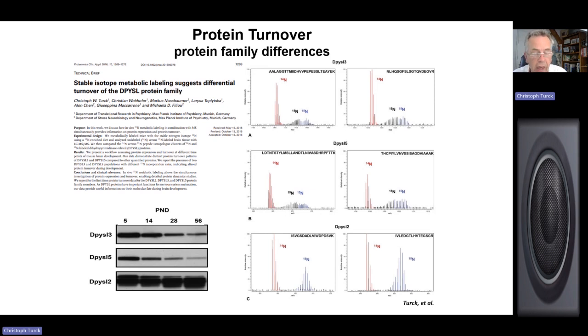You would isolate neuronal cells, astrocytes, glial cells, or whatnot, and then see if you can untangle these 2 little bumps here and which turnover belongs to what cell type. But it's a very interesting result that again emphasizes the fact that the brain is so complex, right? It's not like a liver where you probably have pretty much only one type of cell and probably one type of turnover. In the brain, everything gets a lot more complex.